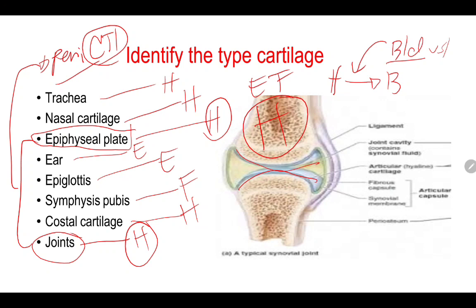Okay? So, I think that is our topic for the cartilage. I hope you understand and you are able to identify the different types of cartilage when I ask you to do so, no? Both microscopically or sa ating projector. Kasi guys, it is really hard to study these things if walang magtuturo sa inyo. So, I hope naintindihan ninyo, no? So, please, basahin ng paulit-ulit, pakinggan, and supplement it with the book.